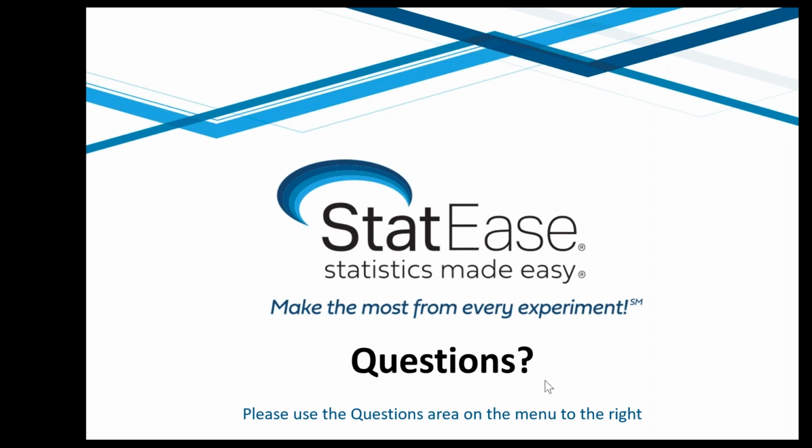Next, Anastasis Mitsopoulos asks, MVA puts data in a plot, but are there no indicators that let you better interpret the data? What if the results create no clusters that are symmetrical? That's a good point. We were hoping to see the pattern that I've been showing. As you remember, maybe the first plot that I showed was not showing at all the pattern I was expecting.